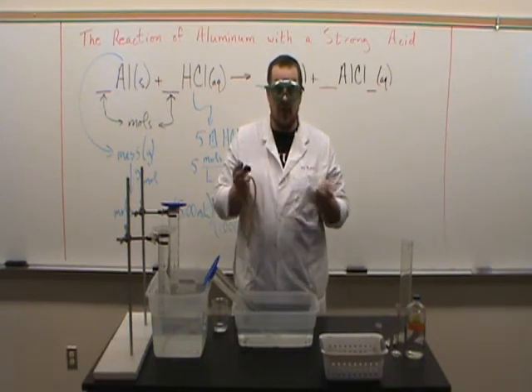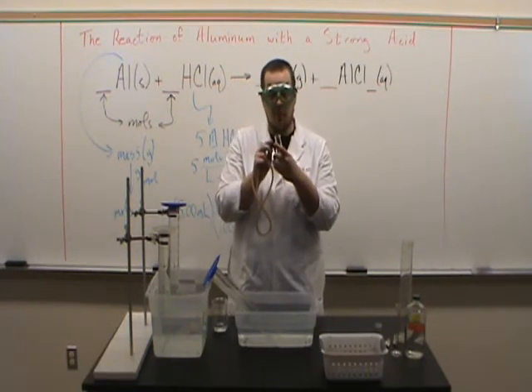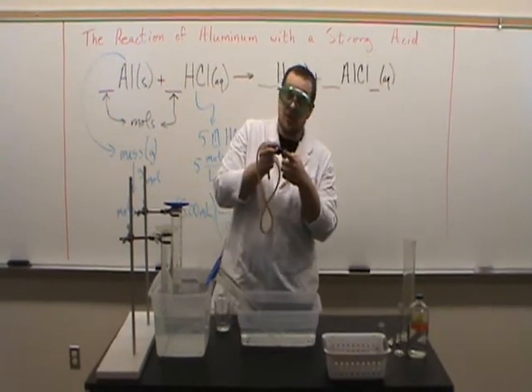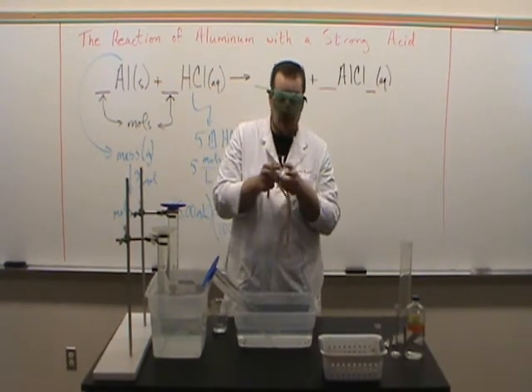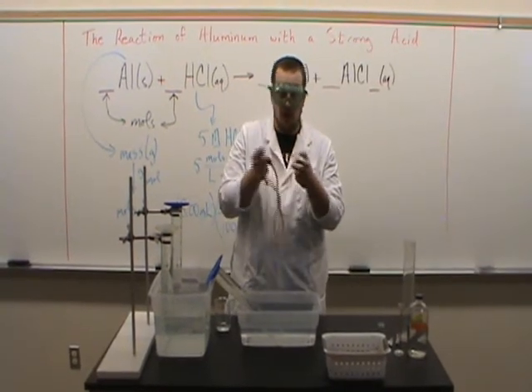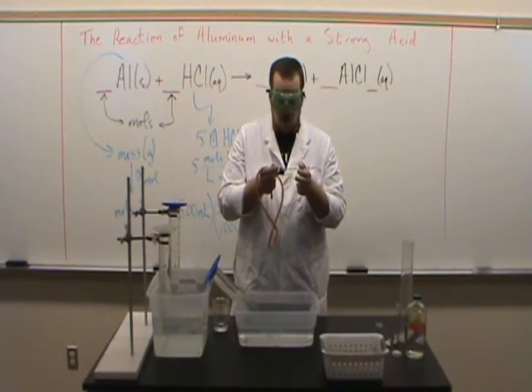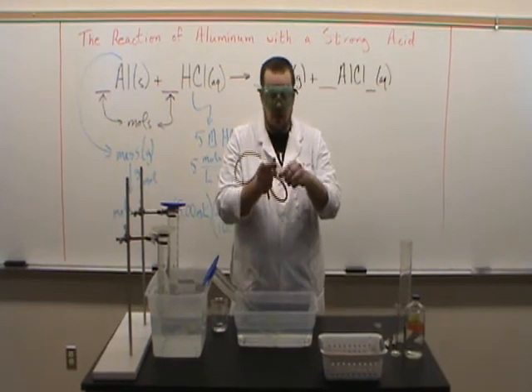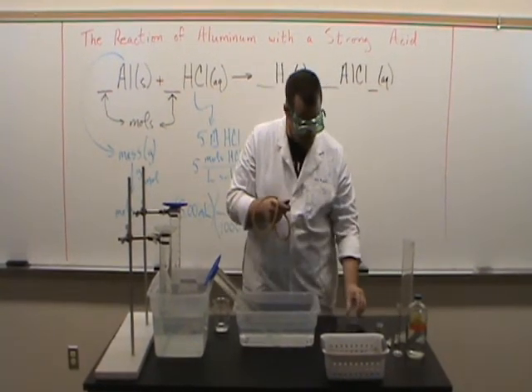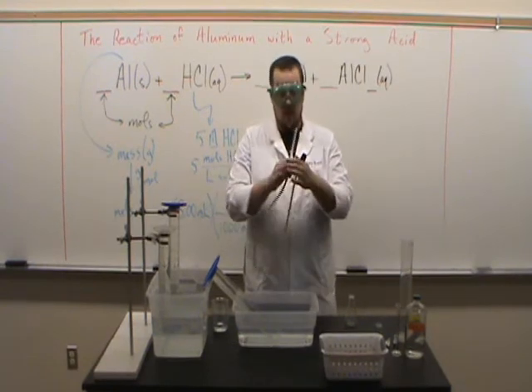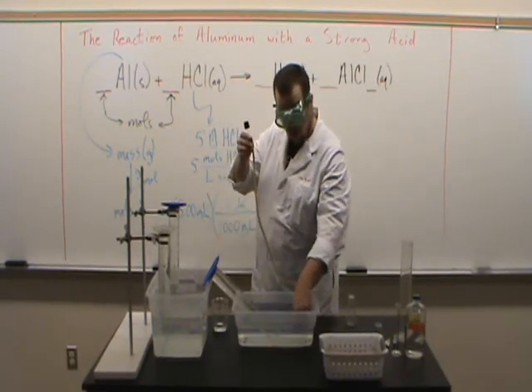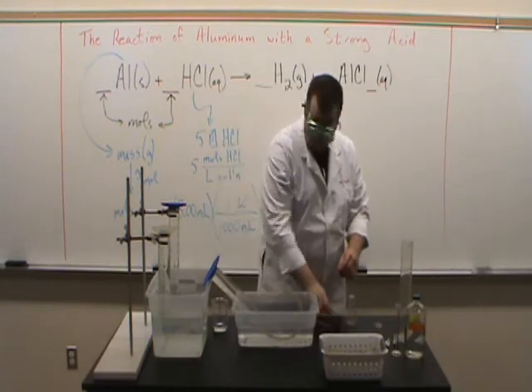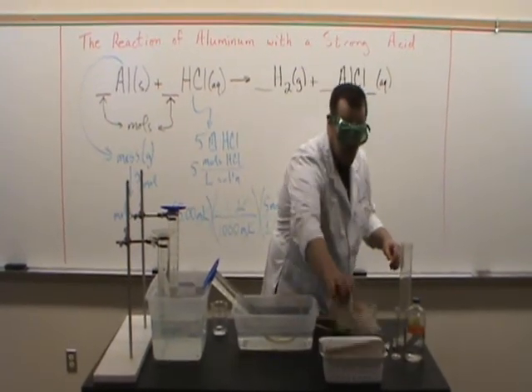First of all, before you do anything, make sure that the stopper that you're using fits in the flask you're using. That sounds pretty basic, but some of the stoppers are a little bit bigger or a little bit smaller, and some of the necks of the flasks are a little bit bigger or a little bit smaller, so they don't always all fit. Like I said, this one looks like it fits really well, so now I can start thinking about the experiment. So this is the flask I'm going to use. Here's my tube. We can go ahead and already snake this tube up into that inverted graduated cylinder.